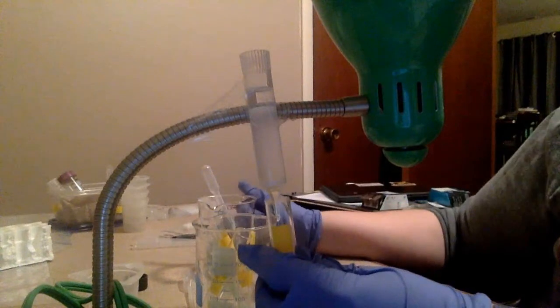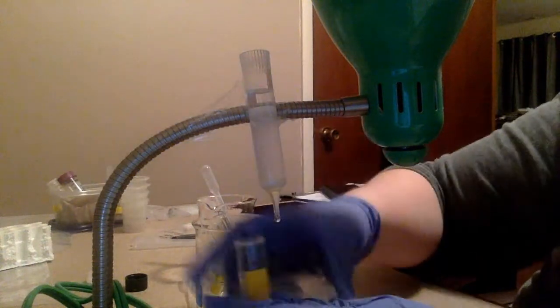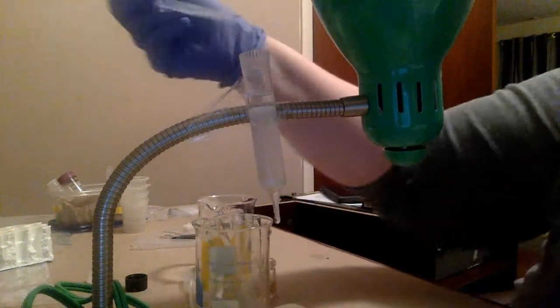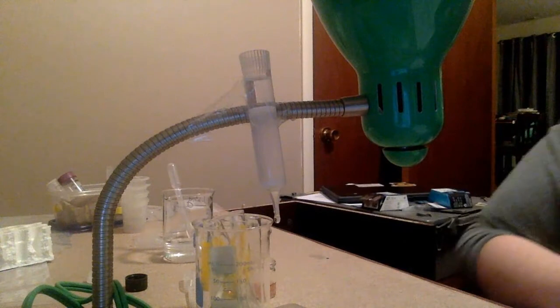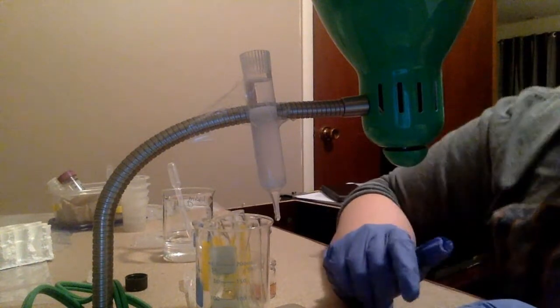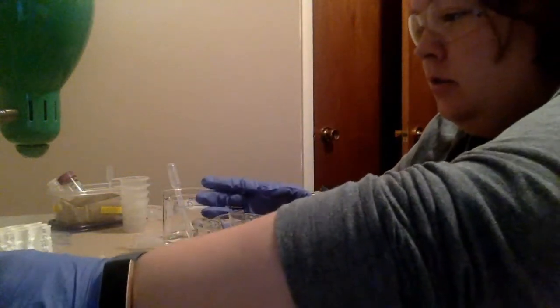just fasten it up and call it a day, because I want to be sure that my column is fully cleaned out. So I'm going to put this waste beaker back underneath, and I am going to fill the top back up so that I'm essentially rinsing out this column for the next person who uses it. And again, because gel filtrations need to stay wet, after this goes through, I need to be sure to fill it back up because they should never dry out. But I'm going to set this column off to the side here.